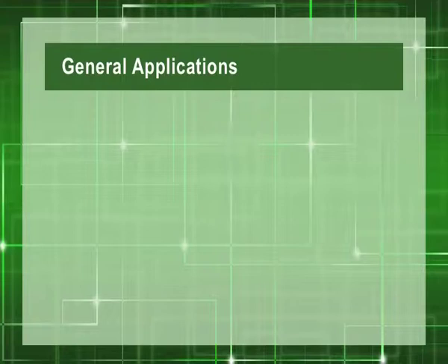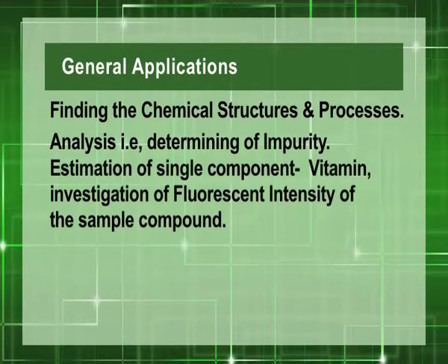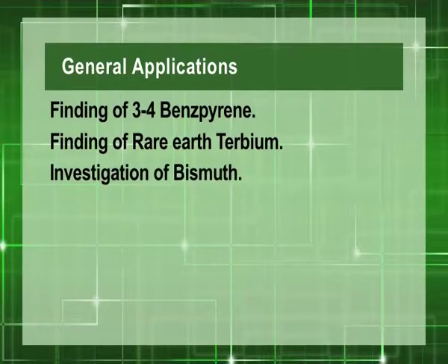The general applications of spectrophotometers are finding chemical structures and processes, analysis, that is determination of impurity, estimation of single component vitamin, investigation of fluorescent intensity of the sample compound, finding of 3,4 benzpyrene, finding of rare earth terbium, investigation of bismuth.